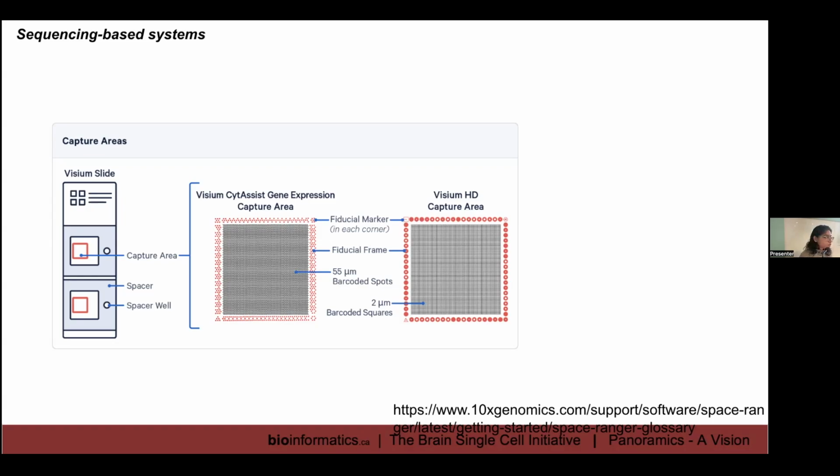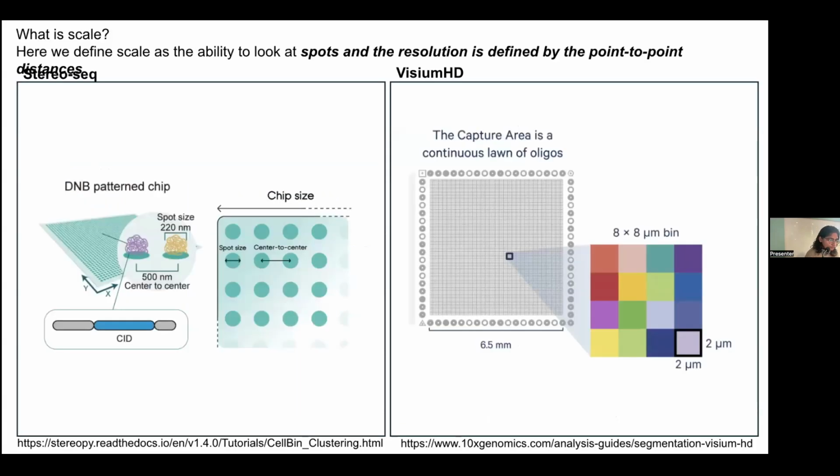How much do you need to bin? These are things that you can adjust for, that come from your knowledge, because you know your projects best. You know your projects better than any of the technical officers from any company. So use that to drive things through.